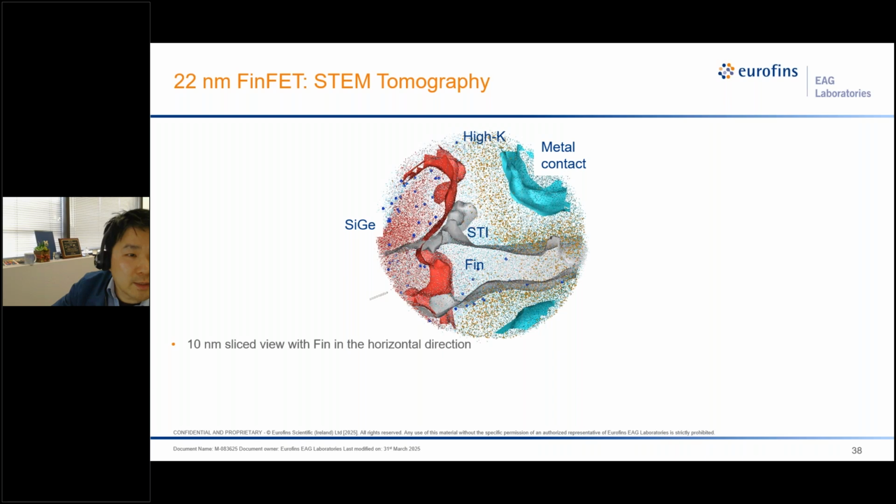So you can see that we actually are suffering from some distortion in this region, in that the SiGe region is compressed by the surrounding oxide, and the high-K region is apparently enlarged due to their field difference.